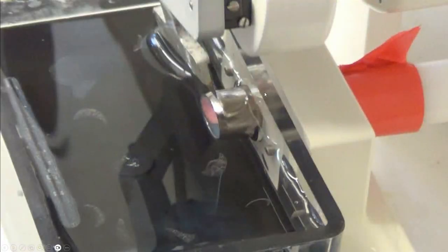So here we are with our settings. For mouse, I usually use an oscillation speed of about 50% of what the system offers, so I'll set that at number 5. I'll have a cutting speed at 5. And we'll start cutting the slices as the rotary component turns and pushes the auger out with more tissue for each individual cut or oscillation of the blade.